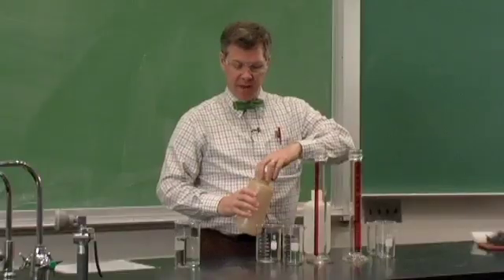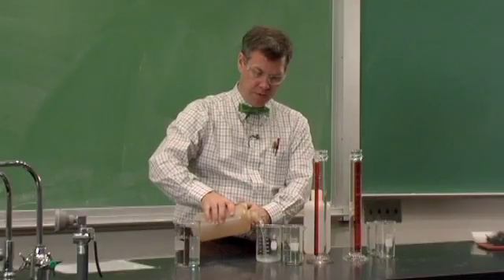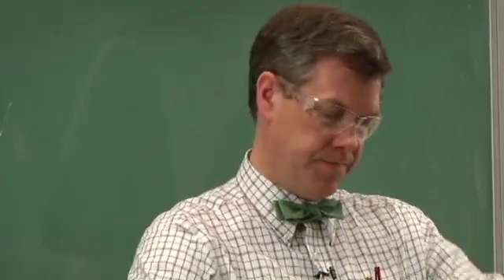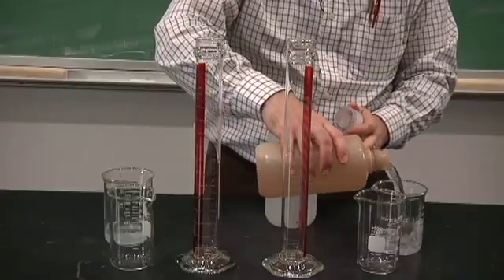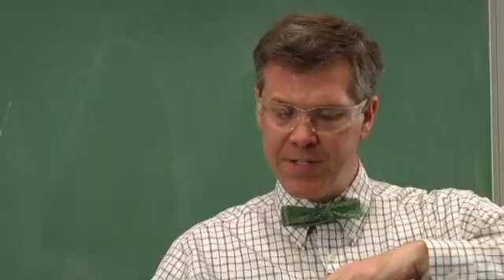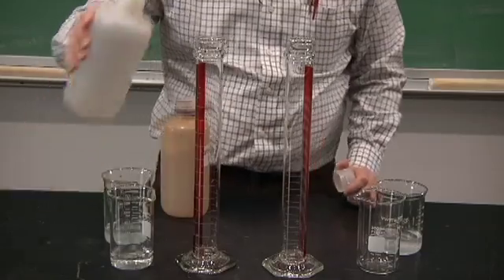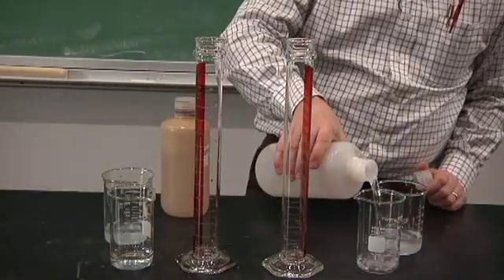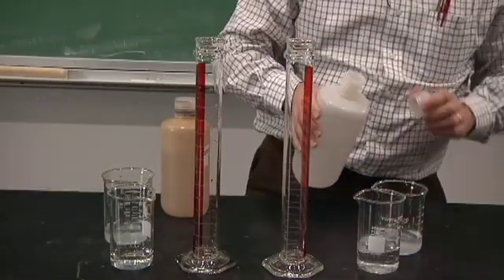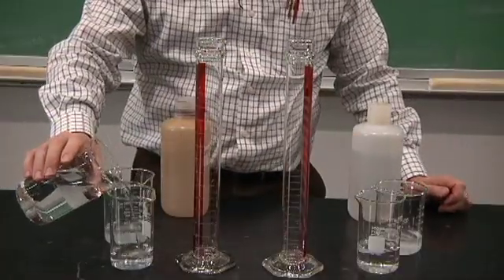Once again we have two parts of our reaction and we'll mix them. Only this time we'll only use half as much of part B on this side. In order to keep the volume the same we'll just add some water.